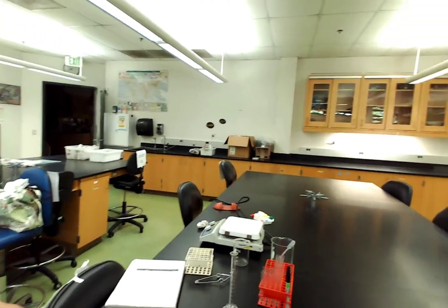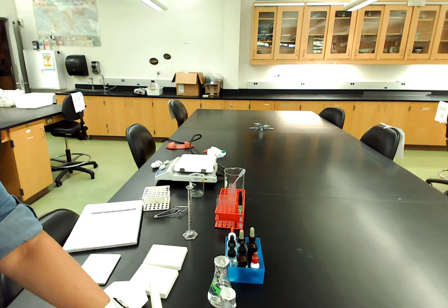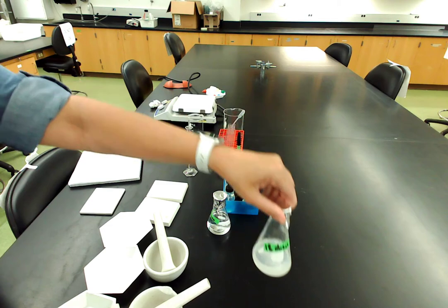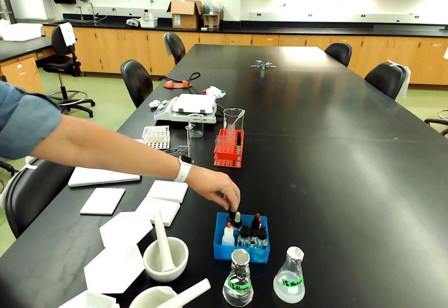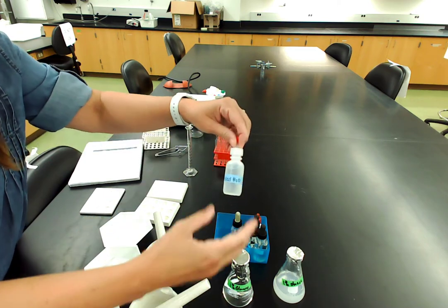The substances we'll be testing for this lab include some of the substances I have over here. So I'm going to turn the camera around. You can see down here, I have a bottle of starch. I have glucose, and then I have this container full of reagents and other things. I have Biuret, so this is your reagent for the Biuret test.